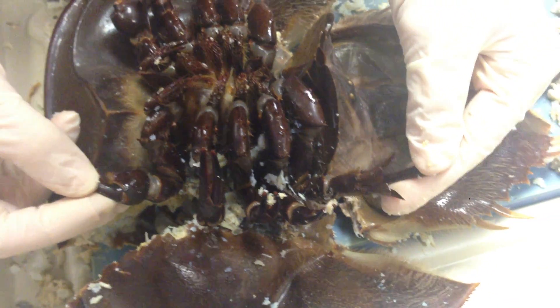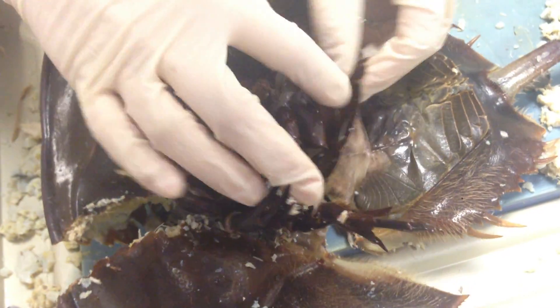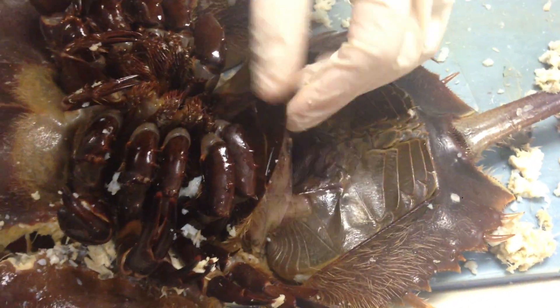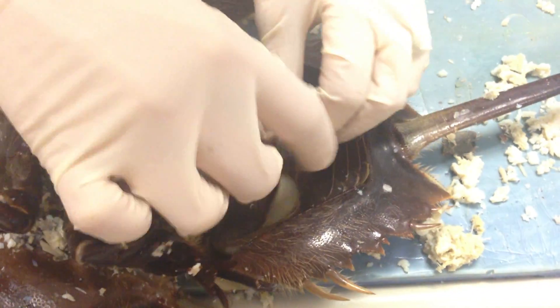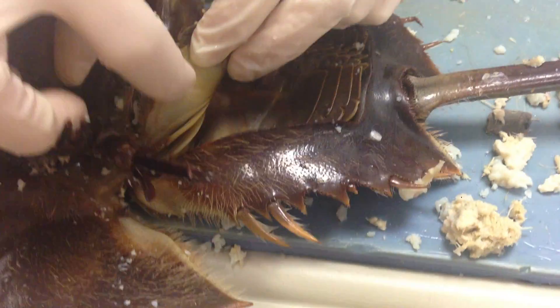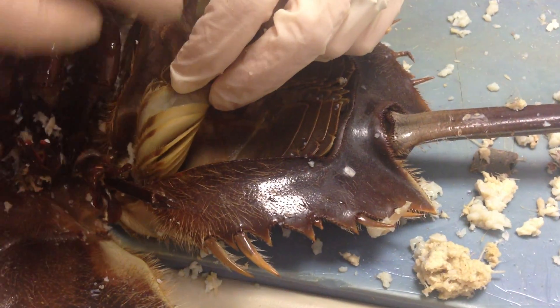These last legs right here are the pushing legs. Down here you can look at the book gills — these are the operculum — and if I pull these back you can see the lamellae right here, and that's for respiration.